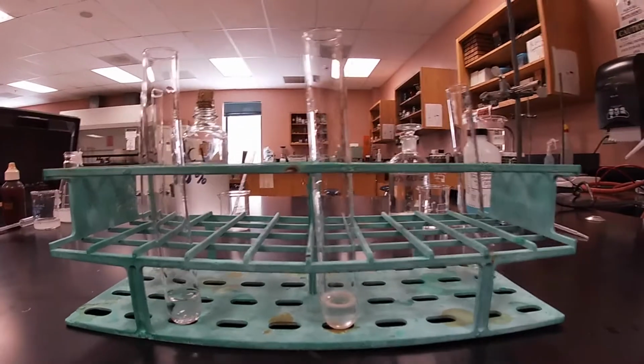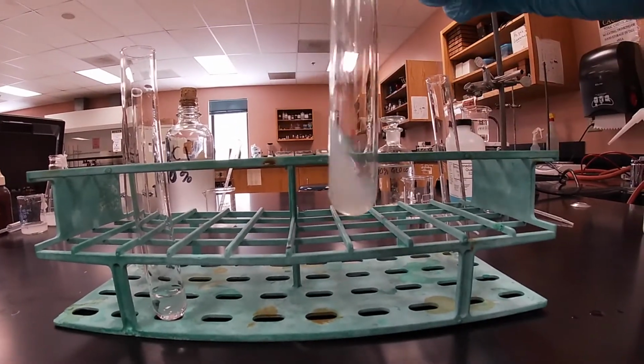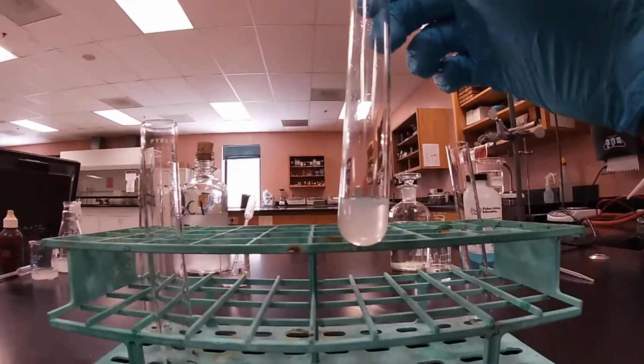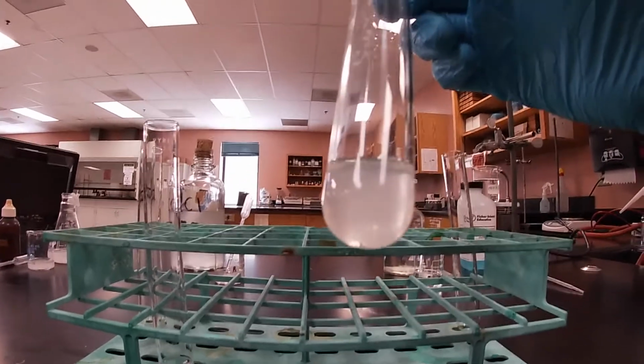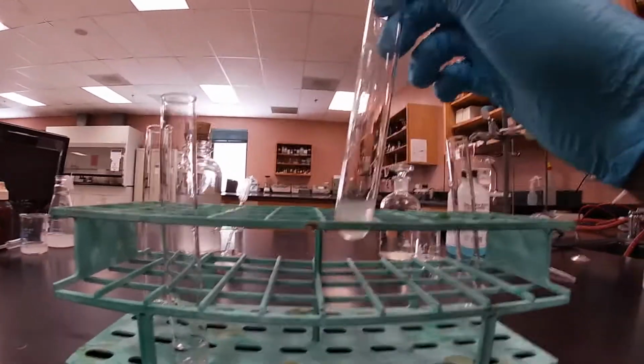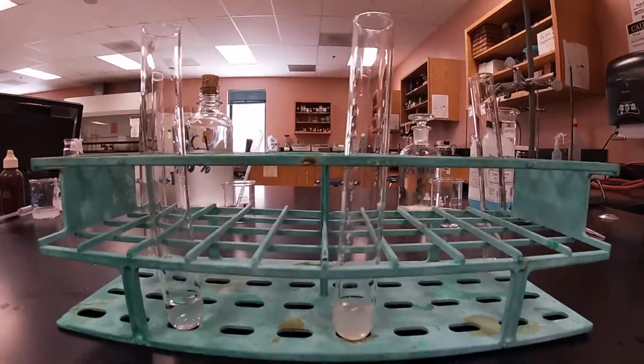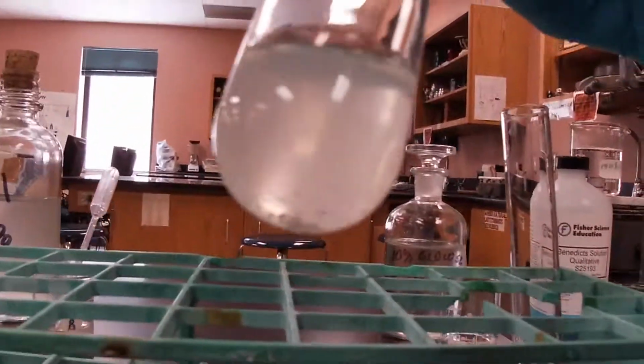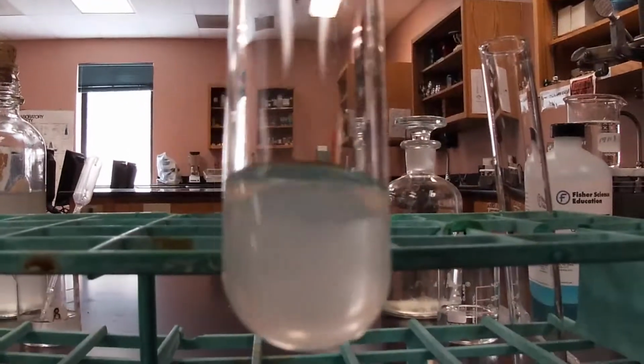Right. And so right now, as you can see, we got little flakes in there of our precipitate. And so for this first test, let's go ahead and zoom it in. And then let me get it closer to you all. If you can see, we have a precipitate at the bottom.